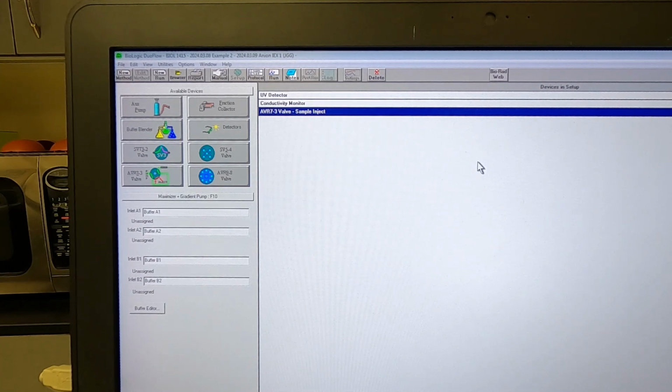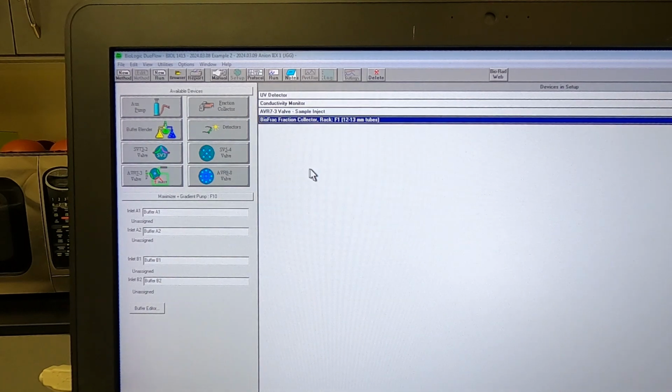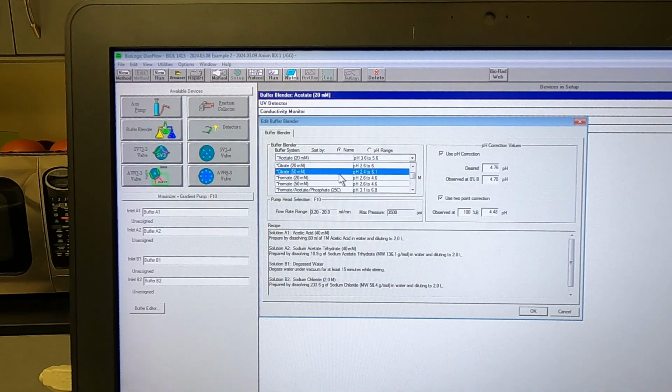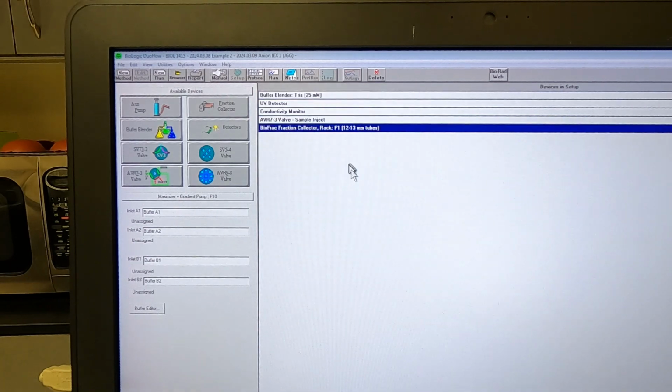So once you've created your method, it's going to go through 3 windows here. The first is the device setup. You're going to tell it what hardware is on the system. By default, it has UV detector, conductivity meter. We're also going to add our fraction collector. So push OK. Fifth thing we want to make sure we add is the buffer blender. So we're going to use buffer blending, and then we'll go to the drop down menu, select our system, push OK. Alright, so now we've got our devices set up.